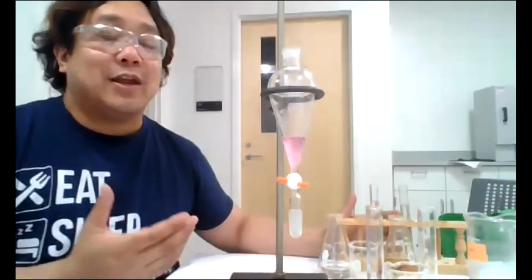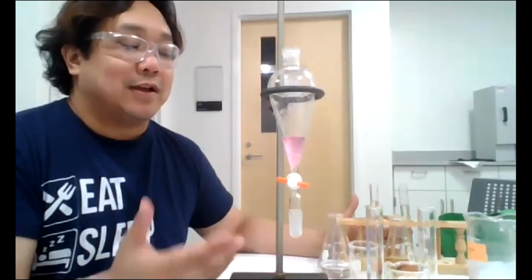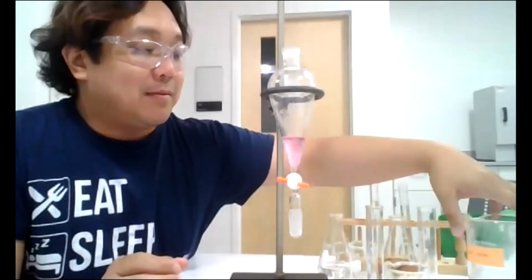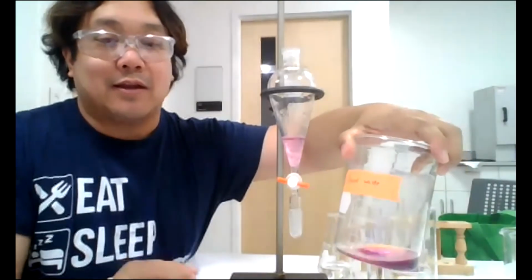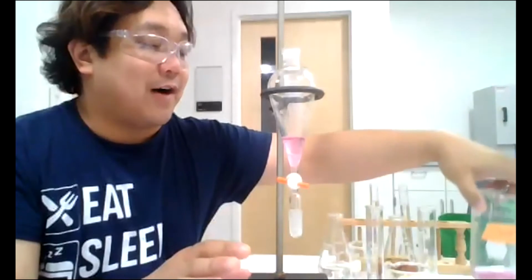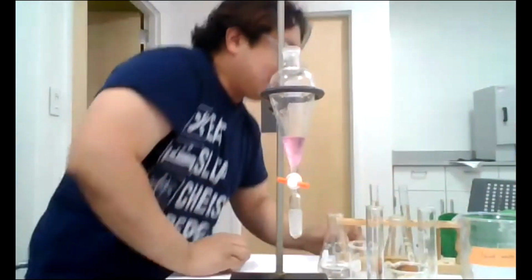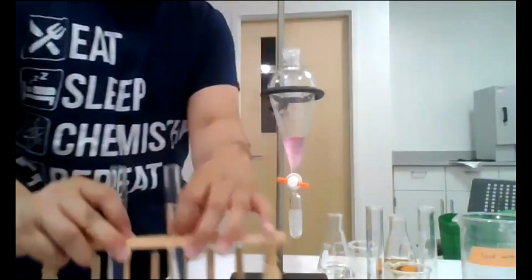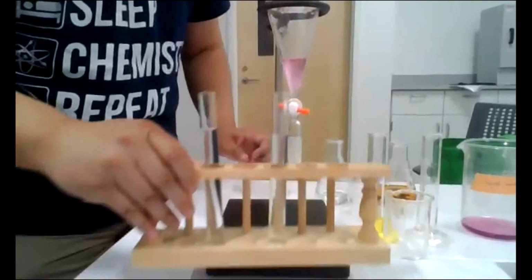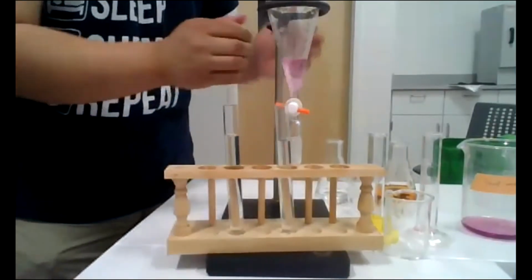A better technique would be to save everything until you know your experiment is done. But I had already put the first organic layer into the liquid waste. That's fine, because what am I analyzing? I'm analyzing the aqueous. So here are my two aqueous layers.